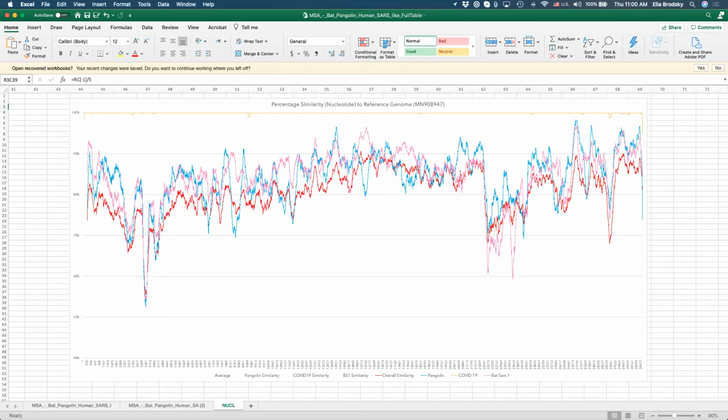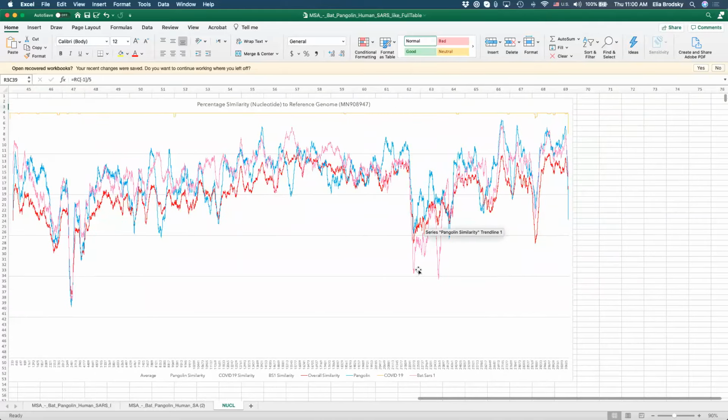Where is the spike glycoprotein? Who remembers where the spike protein is? 680. Well, right. So maybe you're not exactly. I think 680 is a good number to keep in mind for the future of this lecture, but that's not where the spike glycoprotein is. Remember, this is nucleotide sequences and not amino acid, right? Exactly, Claudia, 22,000. So this right here is exactly the spike glycoprotein.